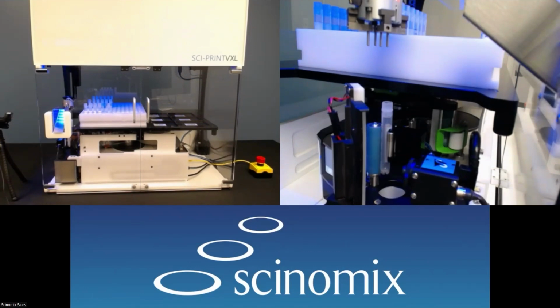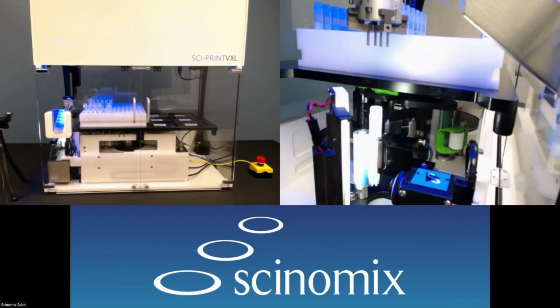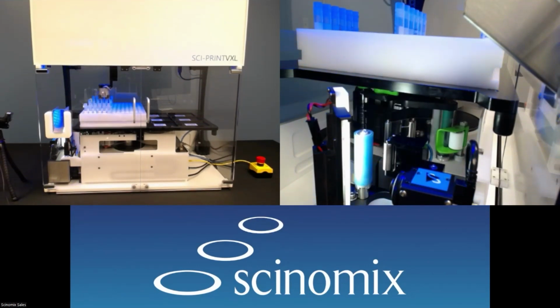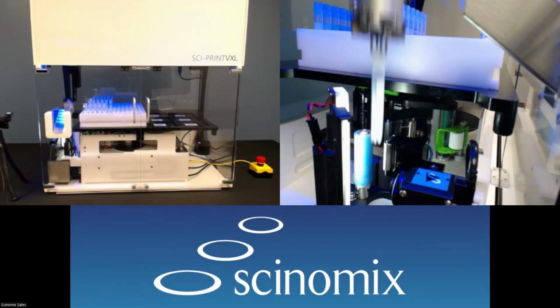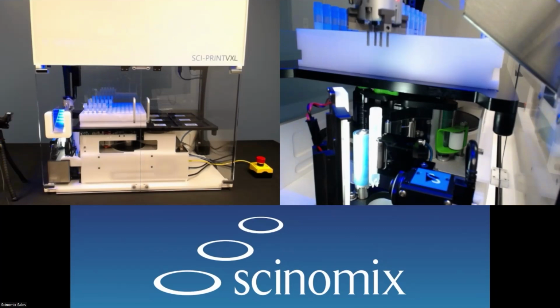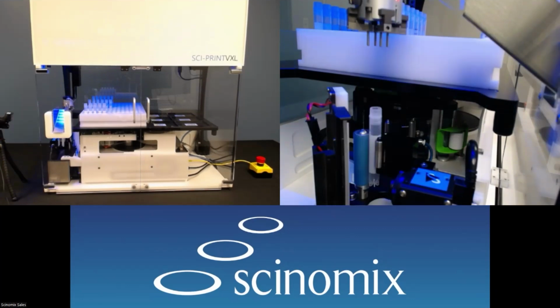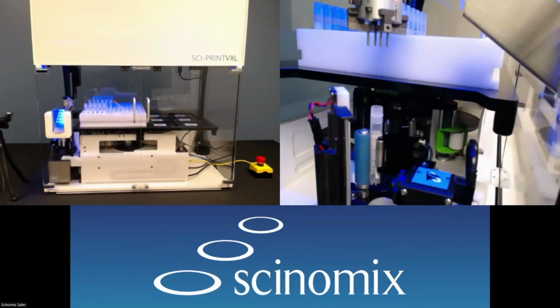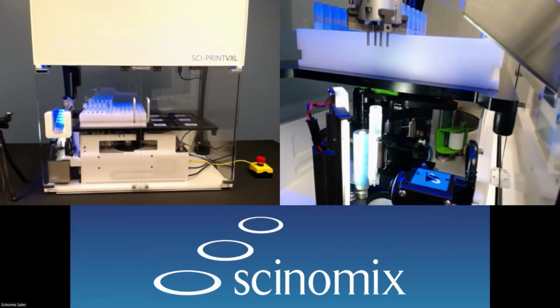So aligning, printing, validating. And then one more for good measure, picking the tube, placing in the roller, doing that first scan, aligning, printing, and then doing that validation scan.